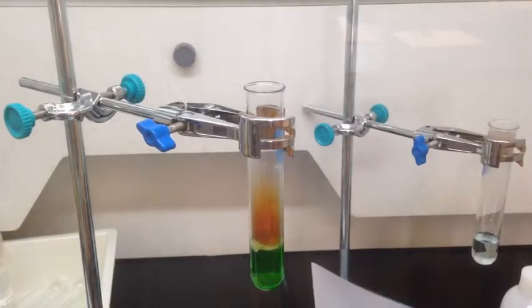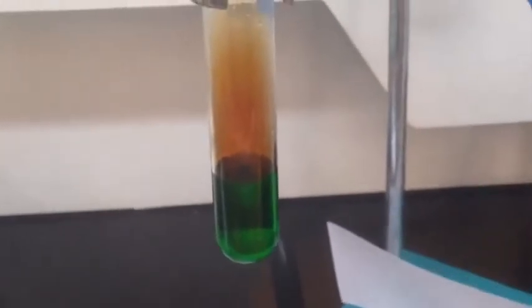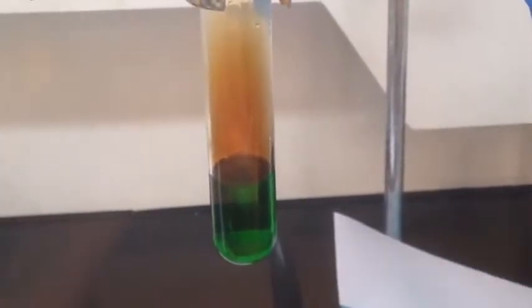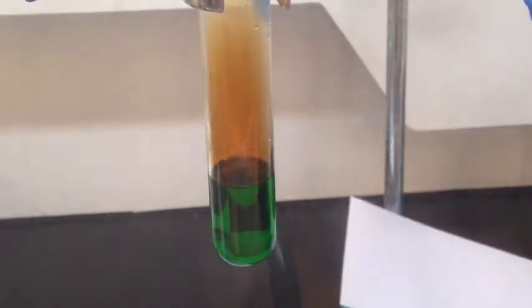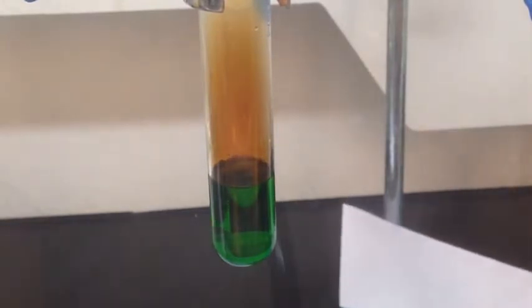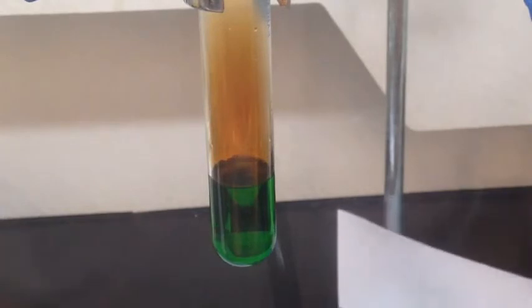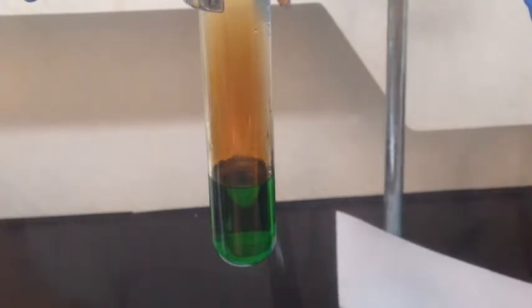As soon as I put it into the acid, you notice the color of the solution turns green. The green color comes from the ions of copper. As we know, copper 2 ion can give us green or blue color. But this one is rather interesting. Most of the time, the copper 2 ions are blue, but when it is coordinated tightly with nitrate ion or with some other ions, then they will give us a very beautiful green color.